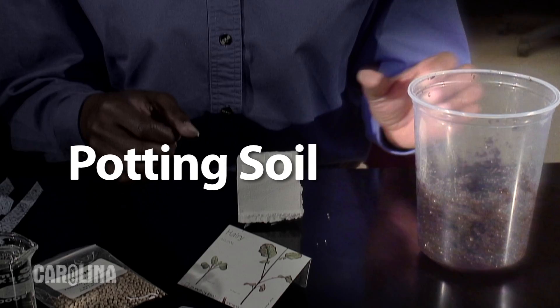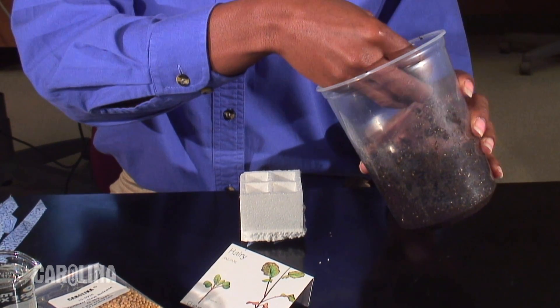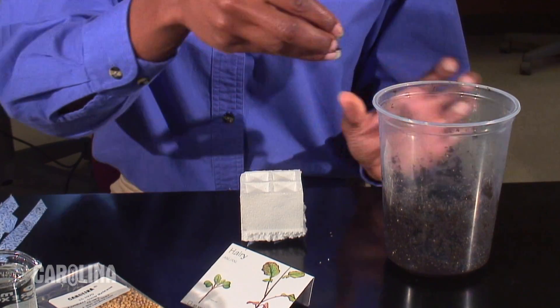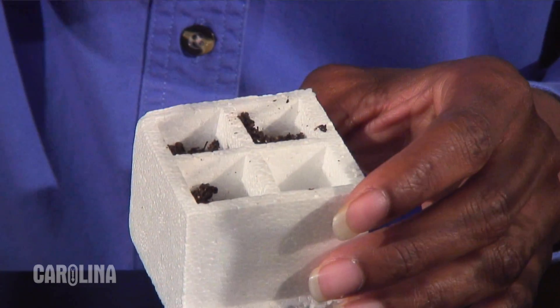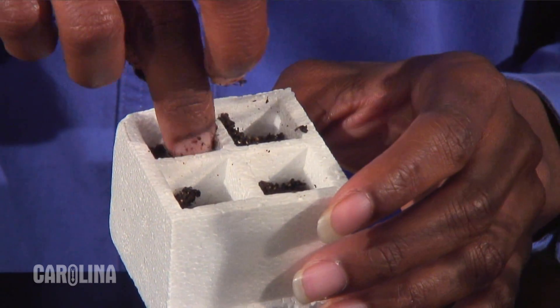This is the potting soil that I have pre-moistened. We suggest using our potting soil because it is rich in minerals and the grains are very fine. Half fill each chamber of the quad with moistened potting soil.